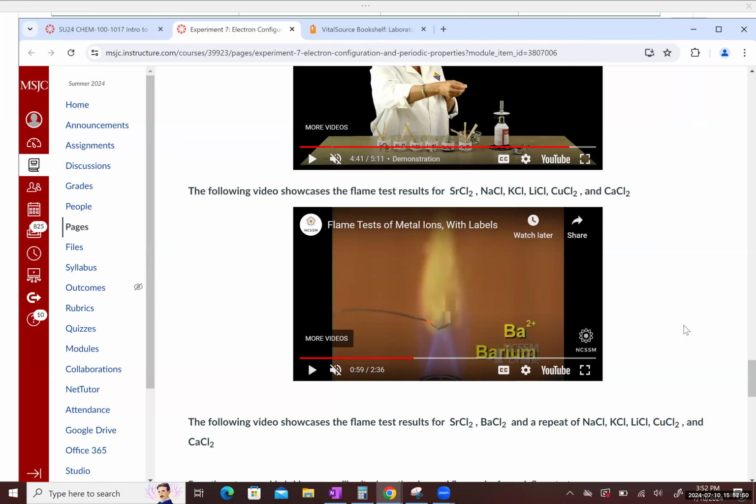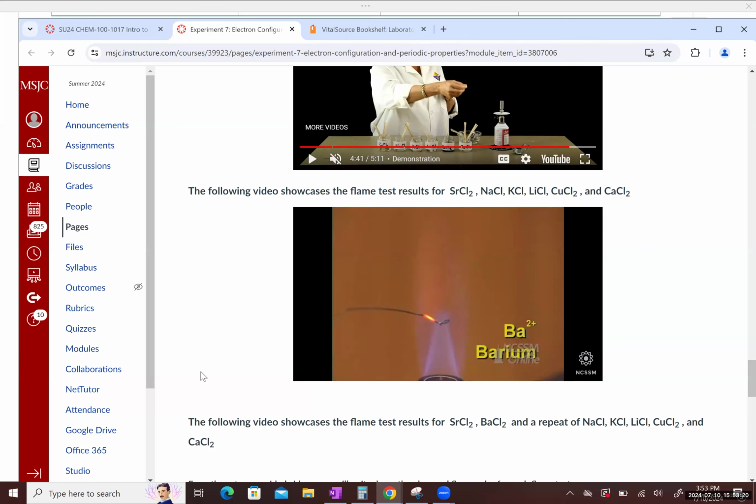More than reasonable. As you can see, we can clearly distinguish barium from something like sodium, where for sodium, as we'll see, it's closer to a yellow-orange color. Again, this is all very qualitative in nature. Just make sure you take your observations, and if you're ever unsure, you can rewatch the videos and even compare the two ion flame colors side by side, and you'll be able to see the differences. Okay, so barium, we filled in that portion of our table.